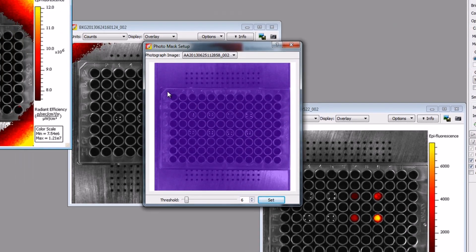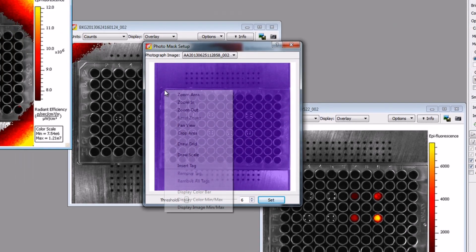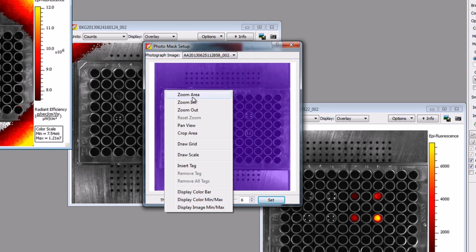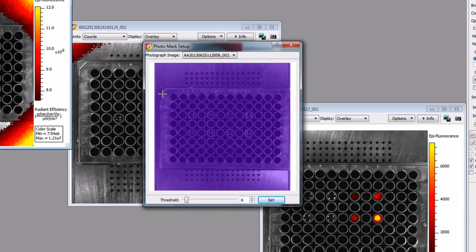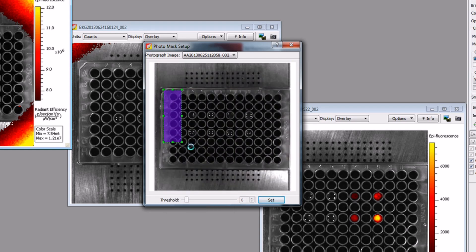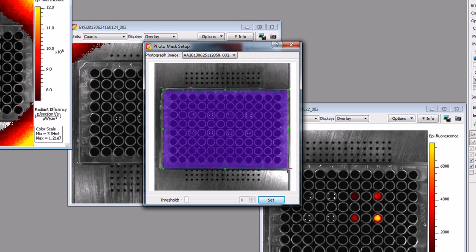For well plates or anything with a dark color, it will be necessary to crop the data. Right-click on the image and select Crop Area. Using your mouse, left-click and drag a rectangular mask over the wells of your well plate. Click Set when done.